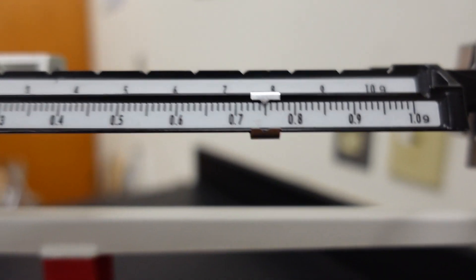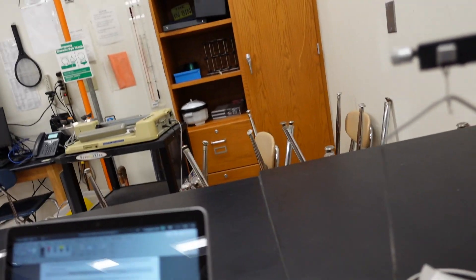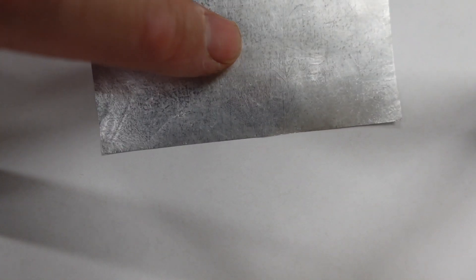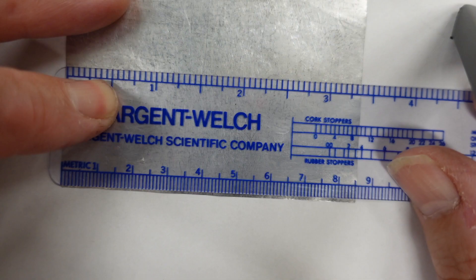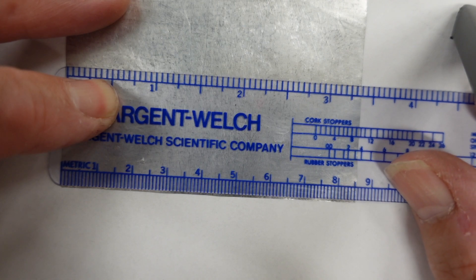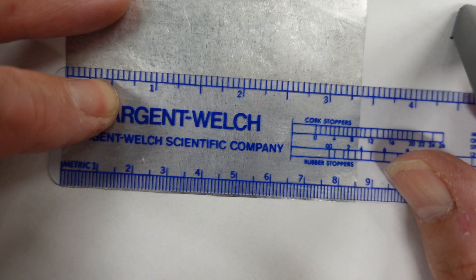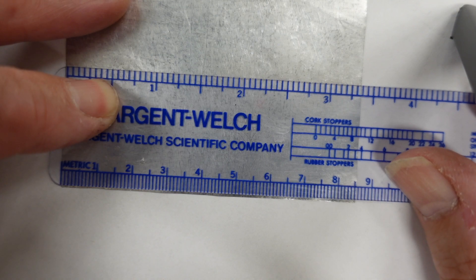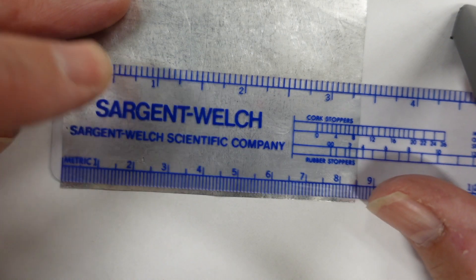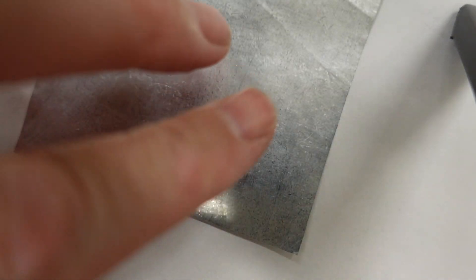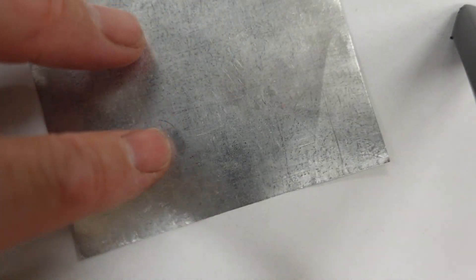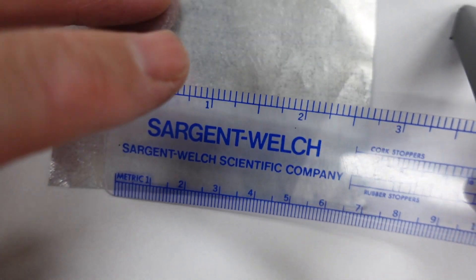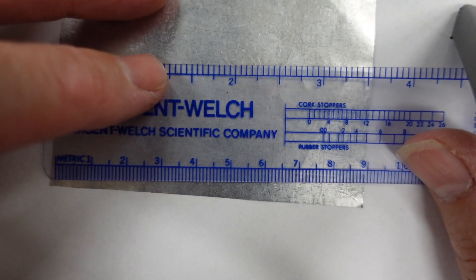Now let's get the length and the width. So there is our piece of aluminum foil. That is the length. Let's get the width by turning it 90 degrees.